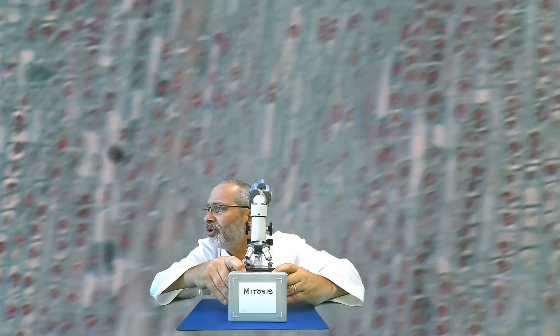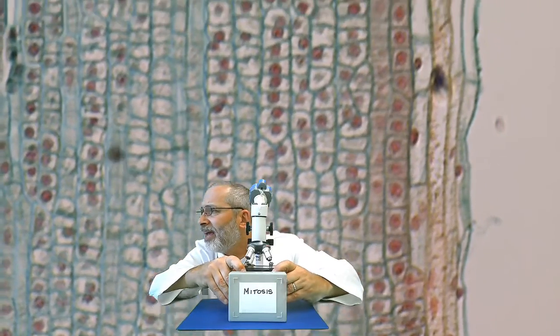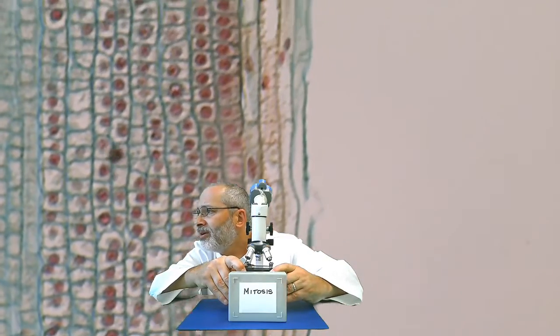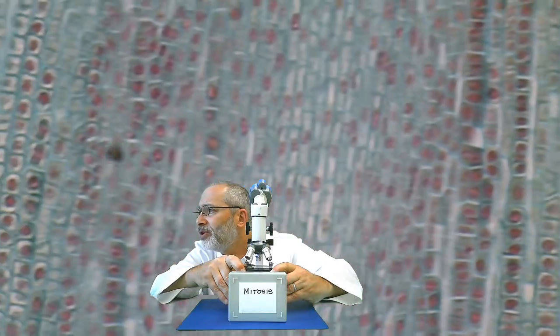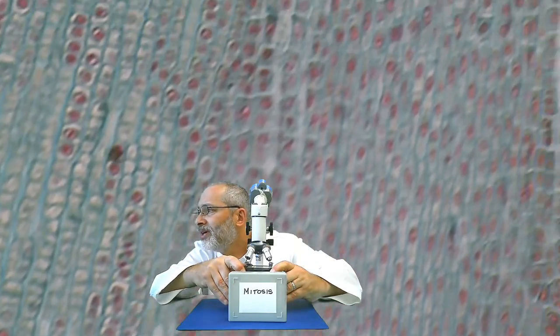Now you'll notice all the green lines are the cell walls, and the darker red or purplish colored areas are the nuclei. And you can see as we hunt around, and part of it is just exploring your field of view here to try to see some cells doing stuff.